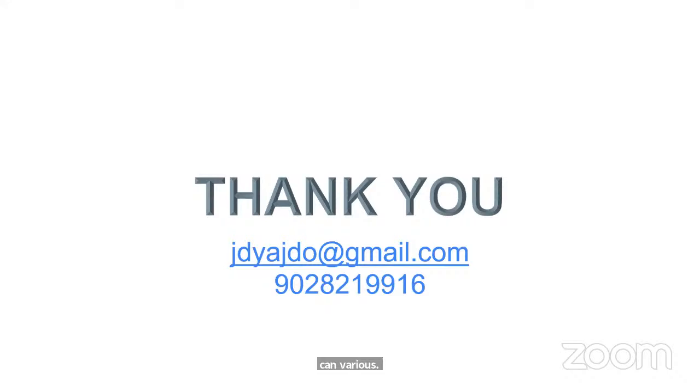The 12 months CV percentage will be calculated, to see how much it varies from each month. For that you can look into the CLIA guidelines 2024 for acceptable CV percentage. Those have been published recently, a couple of months back.